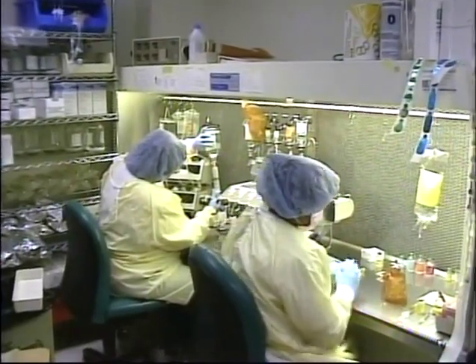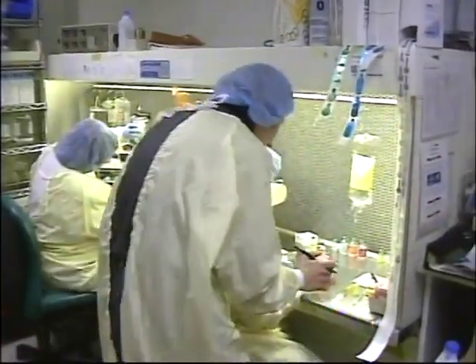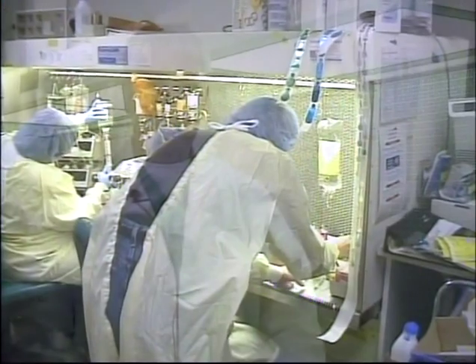Personnel who use laminar flow hoods are likely to feel secure about the aseptic procedures that are carried out inside the hood. The physical presence of the hood and the sound of the air passing across the bacterial retentive filter provides a psychological assurance that the environment inside the hood is safe and the admixture is protected from bacterial contamination.